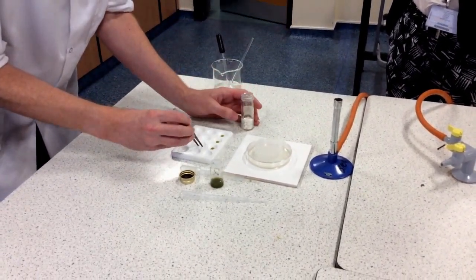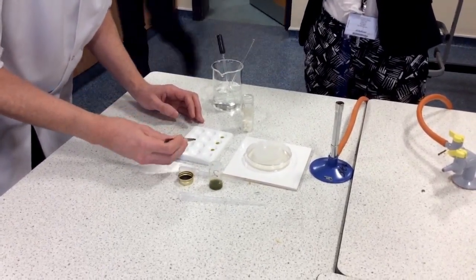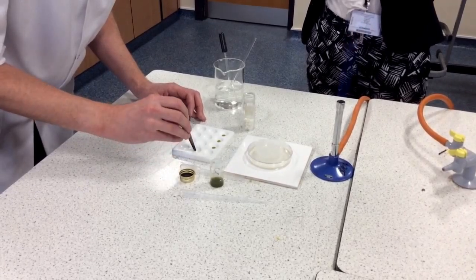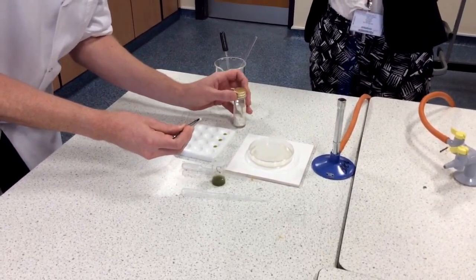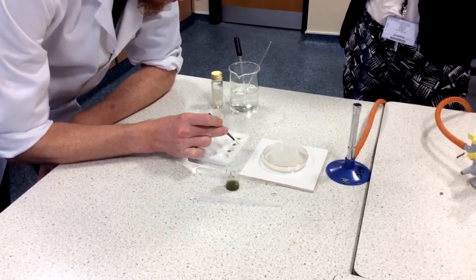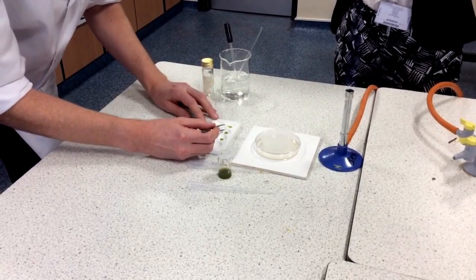I've got some paper discs but they're all in a clump, so I'll try and separate them out. This is very fiddly. I've finally got one on its own. I'm just going to dip that into the edge of the plant extract and quickly pull it out, then dab on the side of the tray to make sure I've got rid of any excess moisture.